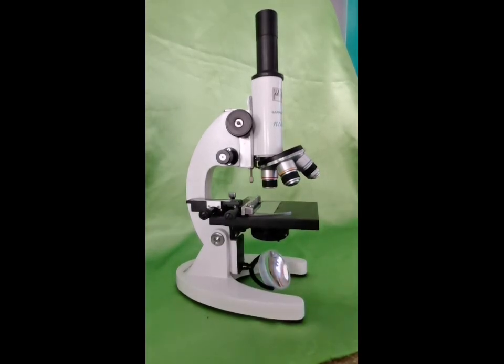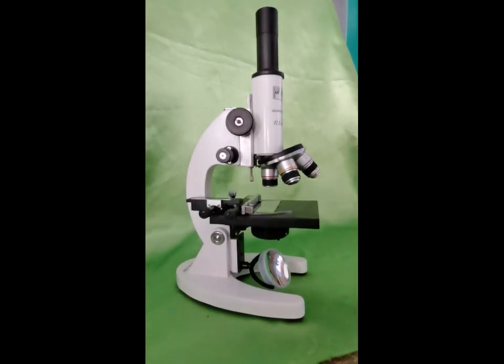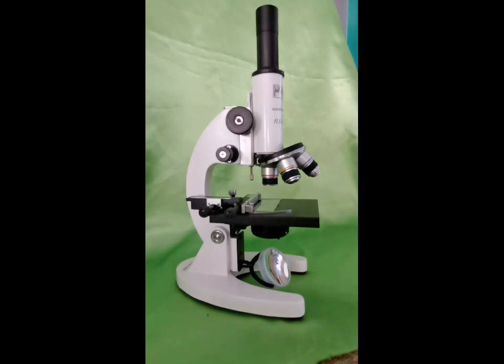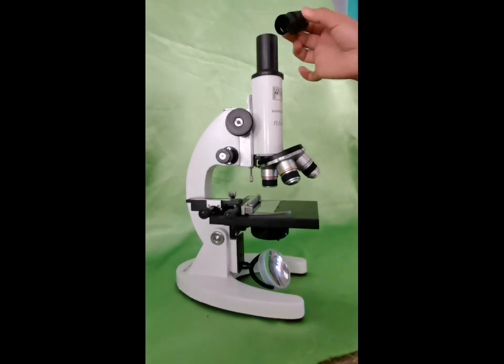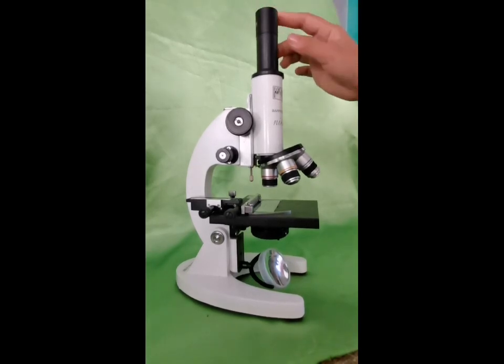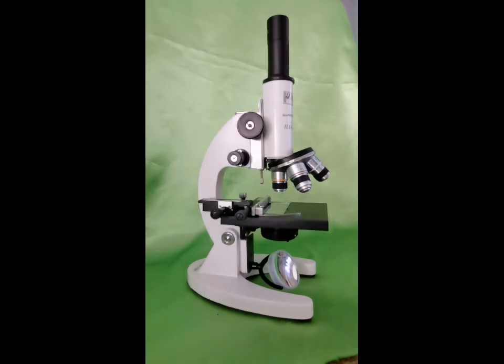The next one is the body tube. It is a hollow cylinder and it connects the eyepiece to the objective lenses and serves as a passageway of light from the object to the eyepiece. Number 6 is the draw tube. It is a smaller cylinder attached to the upper part of the body tube. It holds the ocular or the eyepiece. It puts the proper distance between the eyepiece and the objectives.